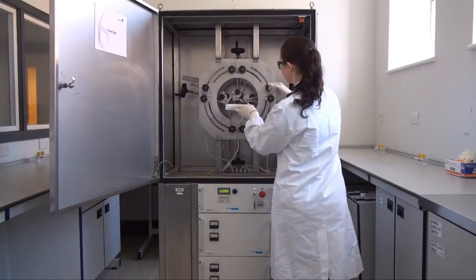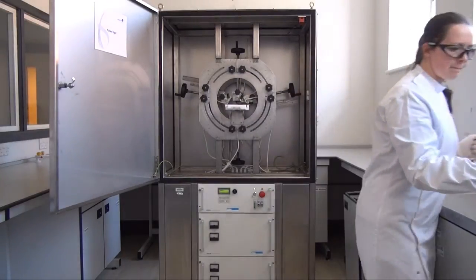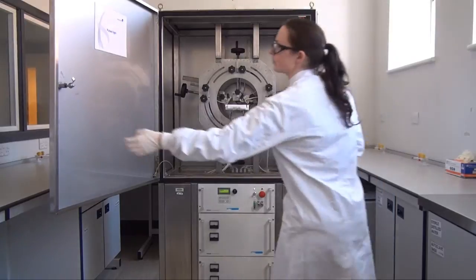The pilot kit is available for trials on a range of materials, to assess the efficacy of the approach for your products, packaging and contact surfaces.